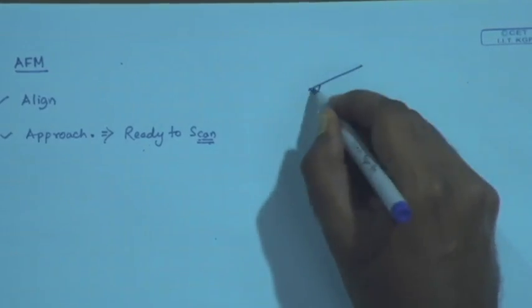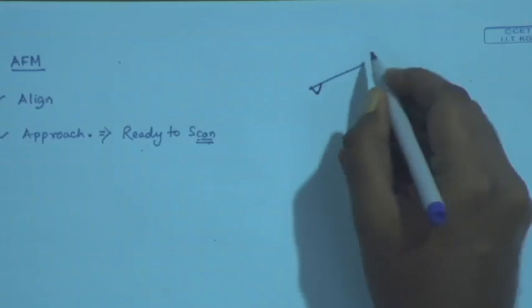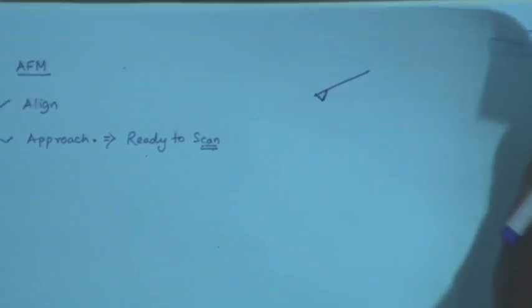Because as a part of this course you have already seen several atomic force microscope images, but none of them are actually photographs, they are data rendered images, and we will see how this data gets generated in somewhat more detail now. So, we now understand the basic components of an AFM. You have a tip, a cantilever, you have a laser source, you have a QPD, you have a feedback loop, and you have a scanner, right.